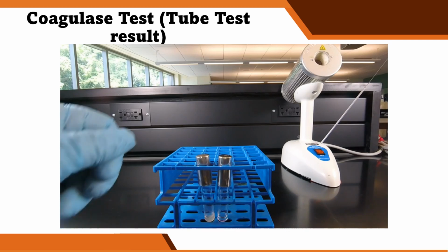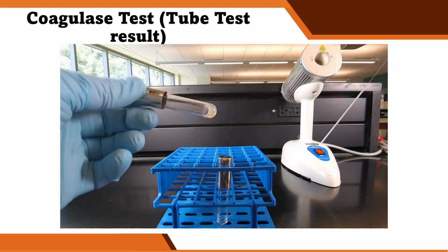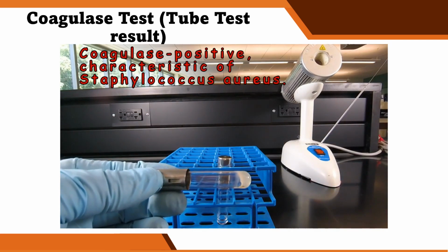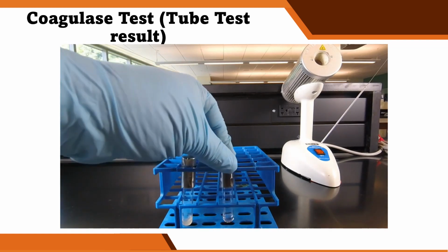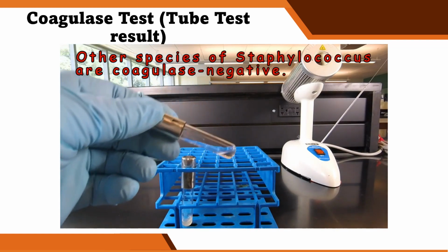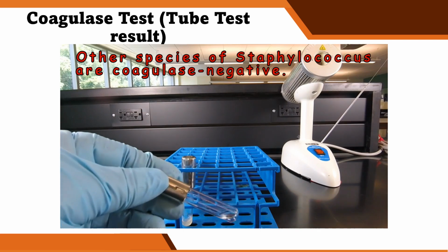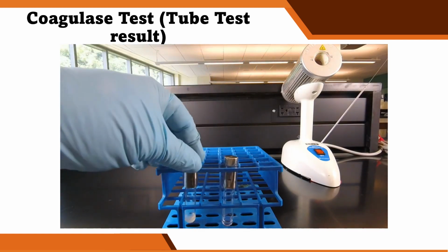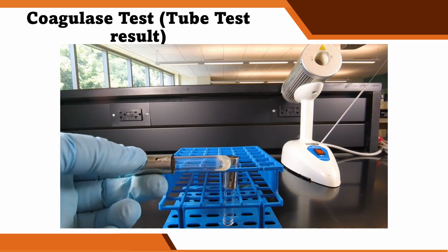So this is a tube of citrated rabbit plasma that was inoculated and incubated. This is a coagulase positive bacterium. We'll see that the rabbit plasma at the bottom has gelled. So that would be coagulase positive. And this is a coagulase negative bacterium. We see that the rabbit plasma remains a liquid. It hasn't gelled. So it's pretty easy to recognize a coagulase positive bacterium because of the coagulation of the rabbit plasma.